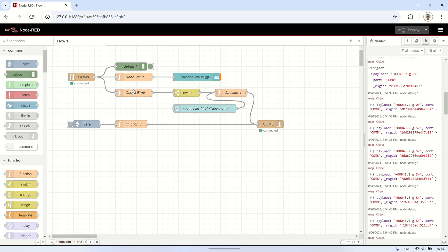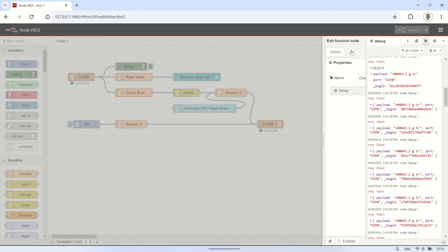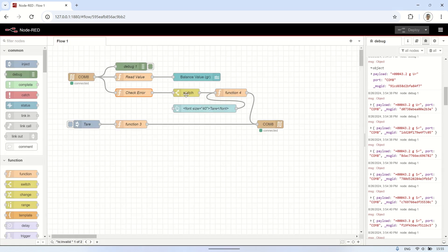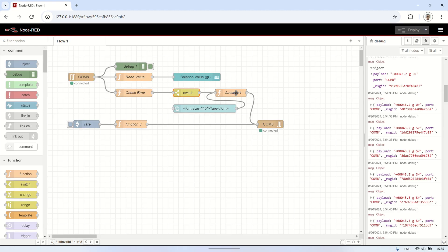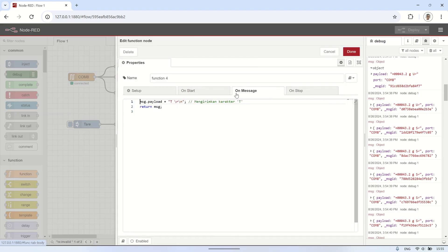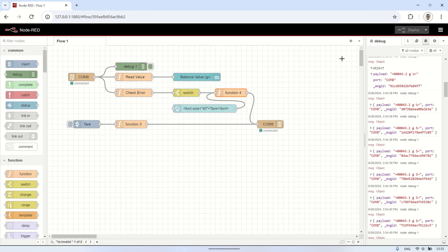Next, I use a function node to check if the serial data contains an error, indicated by a specific character at the end of the payload. Then I connect it to a switch node to verify if the payload contains an error. If an error is detected, the next step is to send a tare command to the balance via the serial out node to initiate the tare process.